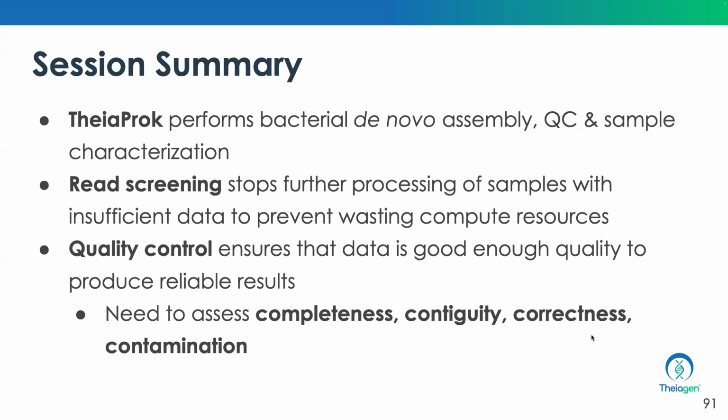This is the end. So I realize that's a lot, but this is aimed to just give you an overview of the workflow. And then I expect that maybe on Thursday we'll have lots of questions that we can go over. And the first question I can see in the chat is, can we start the workflow from the assembled contigs?